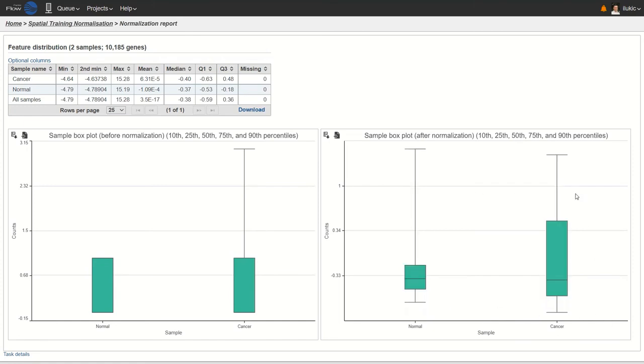And besides, now we see the box and whiskers. It's even distribution of the data values. Please note that with SC transform, you can end up with some negative values, which is expected. For me, my decision was to actually use SC transform in this particular project.